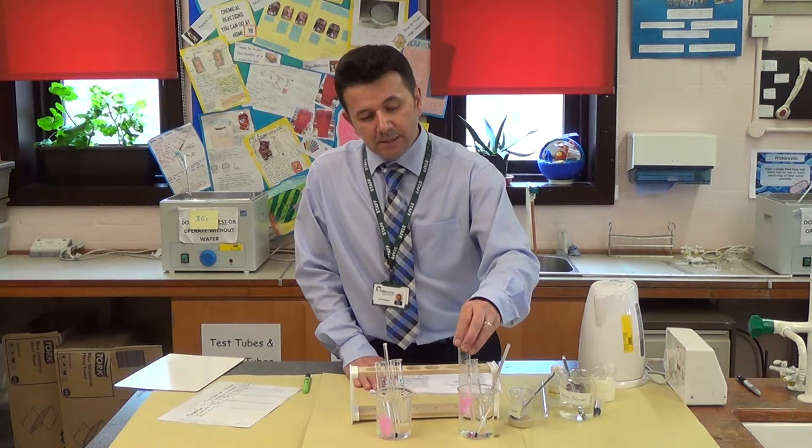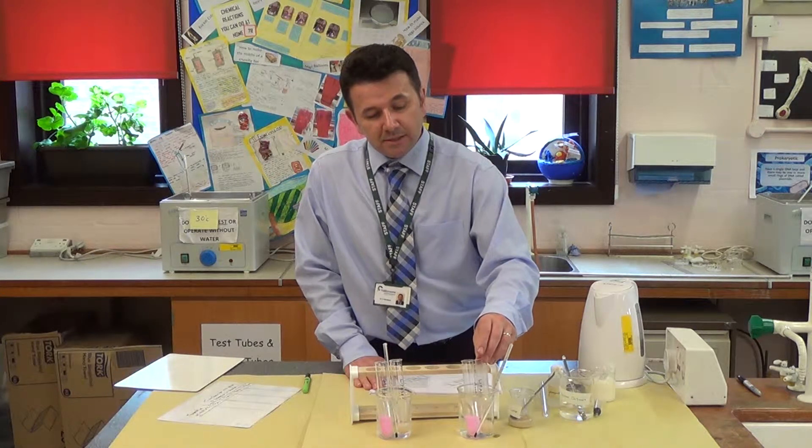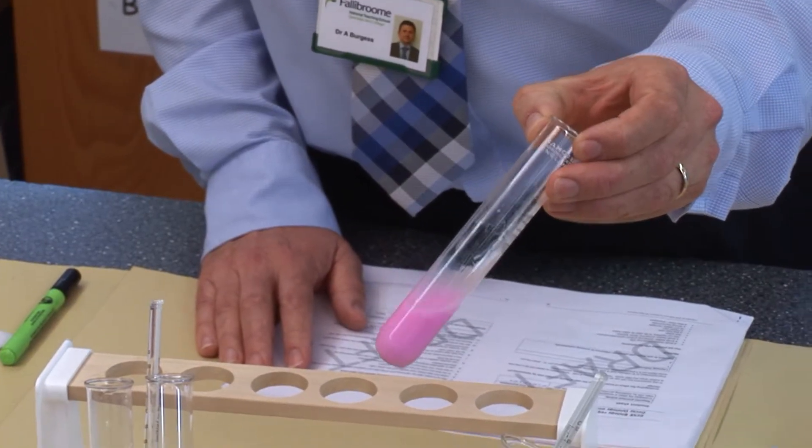Then I will add the lipase to the milk and measure the time it takes for the pink indicator to go colourless. The reason it goes colourless is that lipase is an enzyme that breaks down fats into fatty acids. The acid will turn the phenolphthalein colourless, because it is only pink in an alkaline solution.